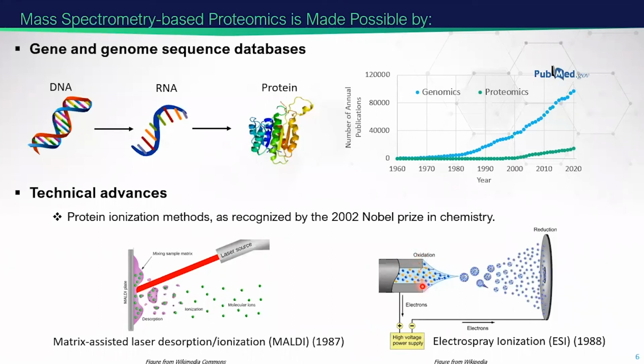Similarly, but not with the exact technique, you can use electrospray, where at the end of the liquid flow you have a high voltage applied. The high voltage will generate a lot of charged droplets too. The charged droplets contain peptides or proteins in water with lots of charges, and the water evaporates and the charged droplet gets smaller, and you make lots of peptide or protein ions, which can be sent into the mass spec.